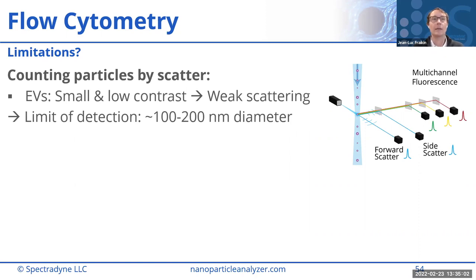And so effectively, there are definitely exceptions to this, but effectively, many flow cytometers' limit of detection for EVs is in the few hundred nanometer diameter size range. And so that's really limiting at this point for using these for EV characterization in the smaller size ranges. Of course, all the big flow cytometer companies are working to drive into the smaller size ranges, so you won't have to wait long.